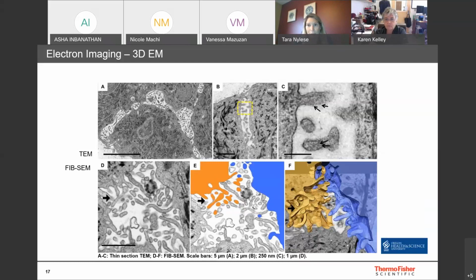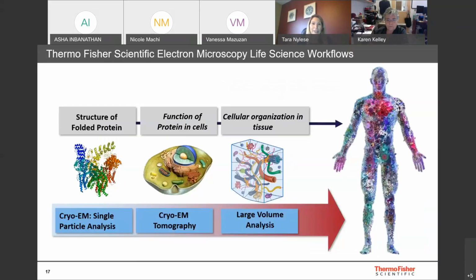And when we move over to image F on the lower right-hand side, we could see that all of those are actually fingers that are coming up into the cross-section that's on the top 2D viewing plane, but they do actually interact and touch with the parent cell at some level lower or deeper in. And so the concept has been around for a while with FibSEM, but we've opened it up with a greater tissue exploration level with the VolumeScope.